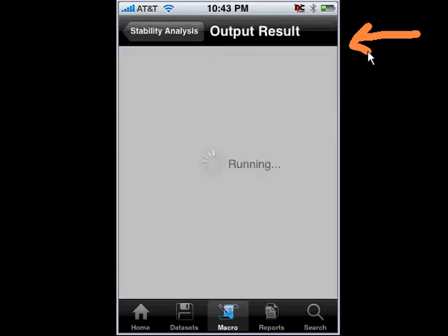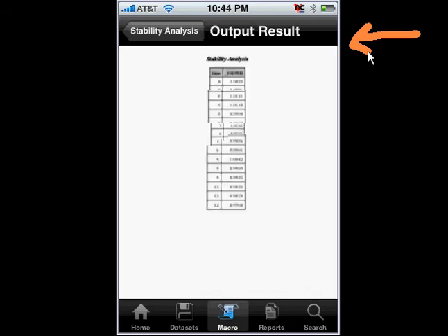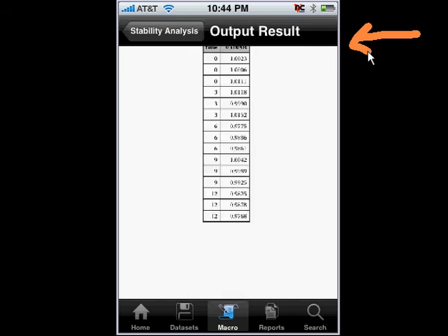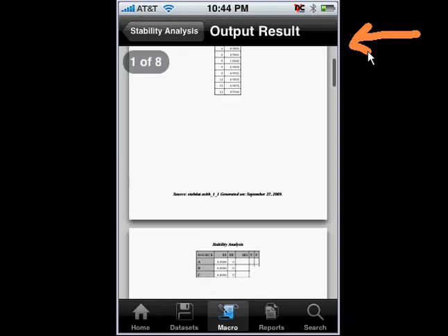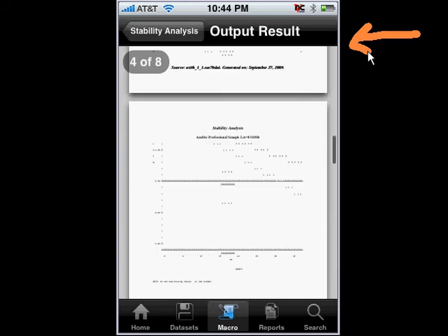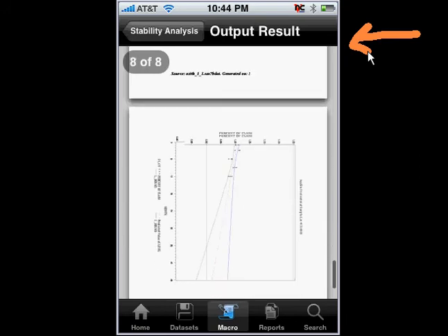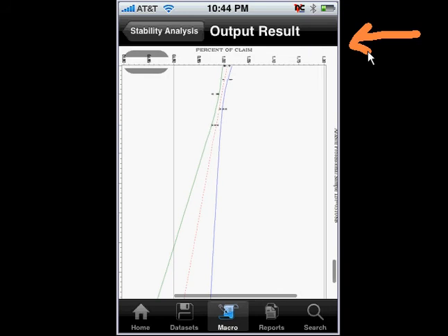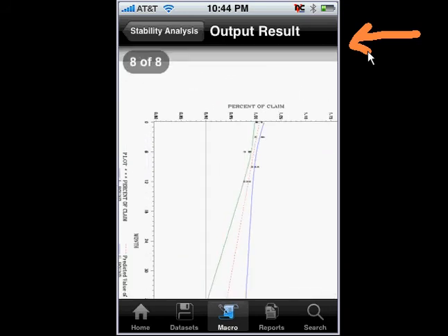This is actually performing the analysis dynamically and then returning the results in the format of a PDF file, which you can zoom in and see the results. In this example, if I go to the final part of the report near page 8, it shows a more graphical representation of the analysis. There are various different text listings, but in this example, it shows you the actual graphical report of that stability analysis.